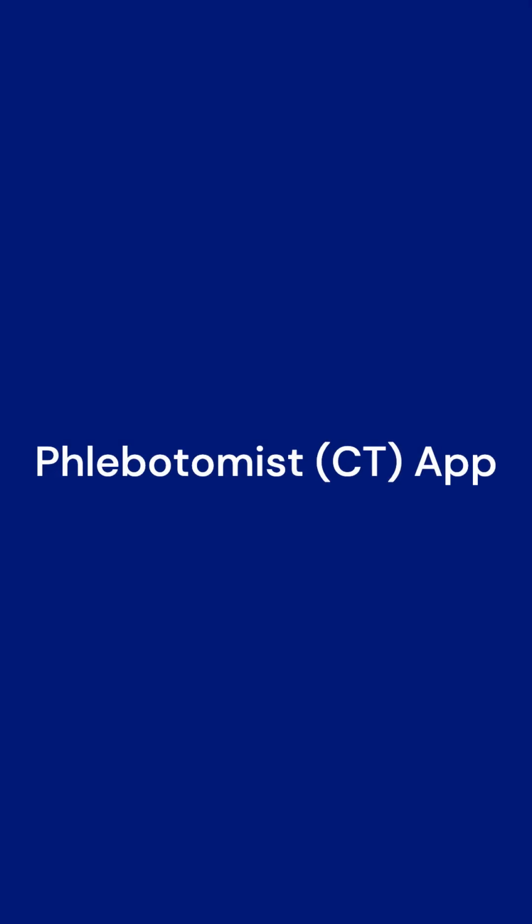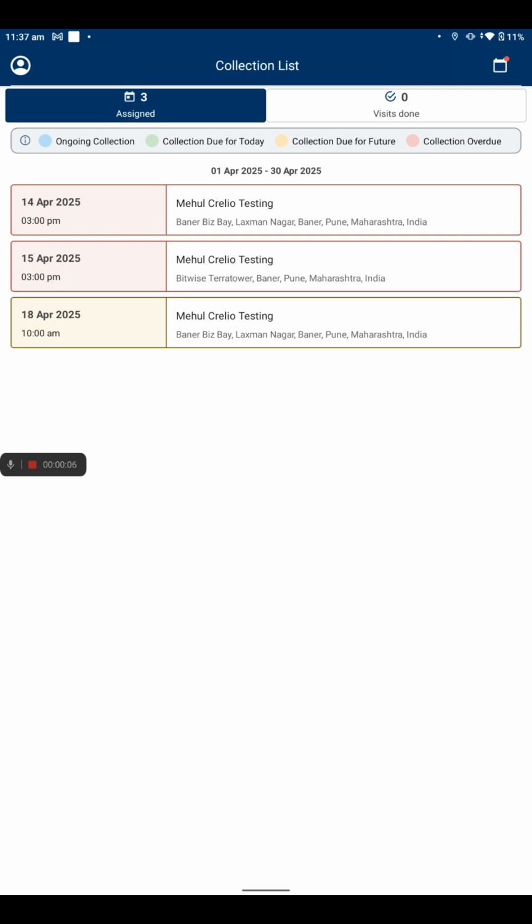Hello, let's see how we capture the COC and other details in Crelio's app. So, this is the app. This is the landing page.